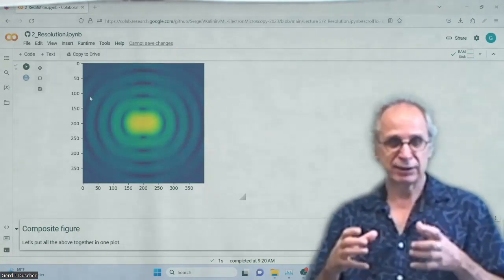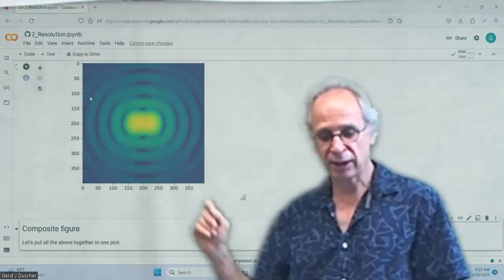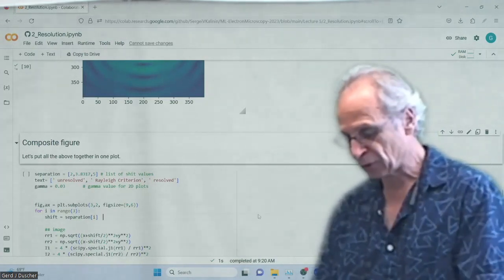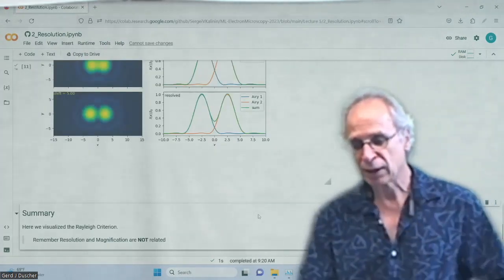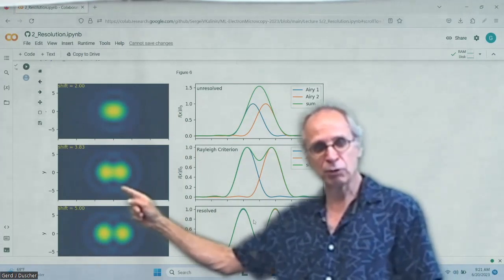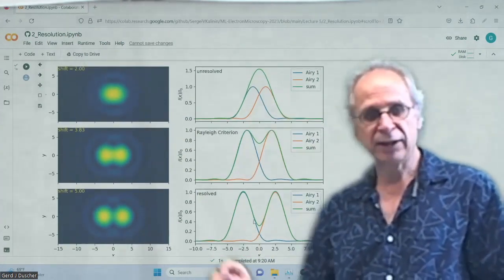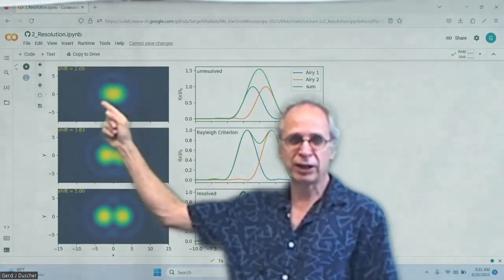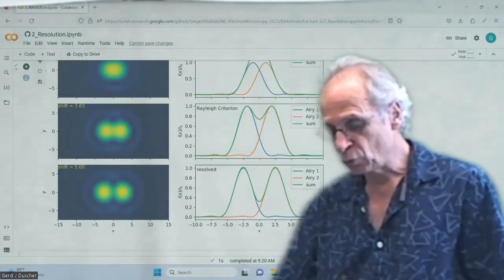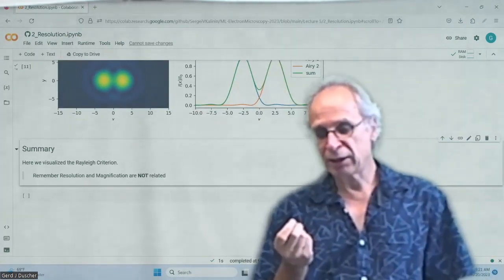Once the pixel size of your detector is changing your resolution, that can happen, obviously. Then your resolution is given by the detector, and so it's a combined resolution. And the Rayleigh criterion gives you something that is just detectable, while here we have an information limit. If you know that your atoms are round, obviously an oval will be two of these atoms. So this is the Rayleigh criterion.